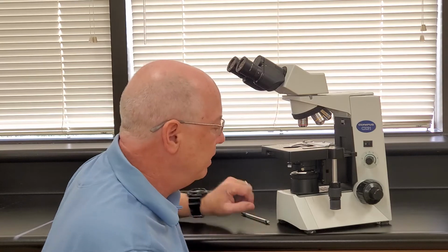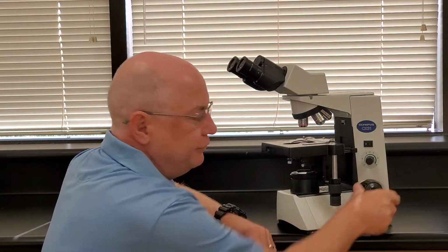Now, we're not going to get to use the microscope together because we're in this shutdown, but I'm going to review the parts for you one last time. This is what you need to know for the lab test. And if you're in my class, you can use the terminology that I use, even though it's written a little differently on the list of things to know.